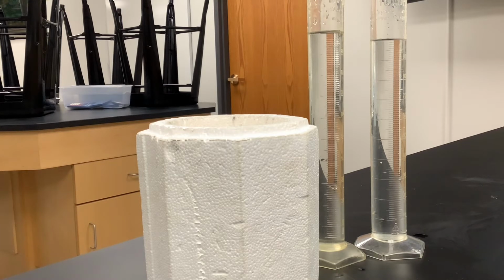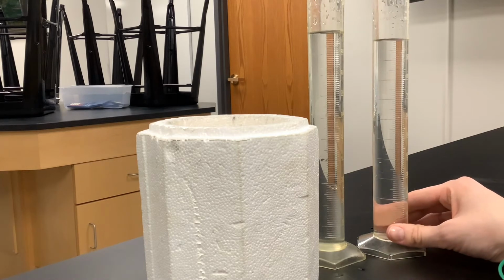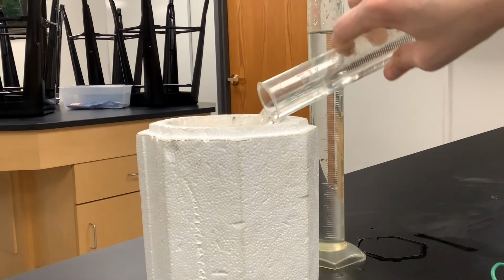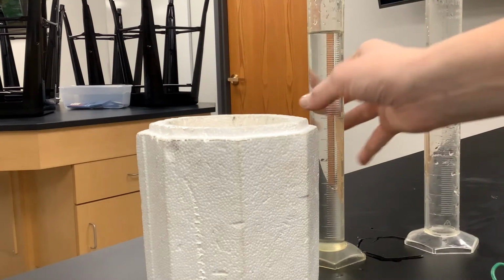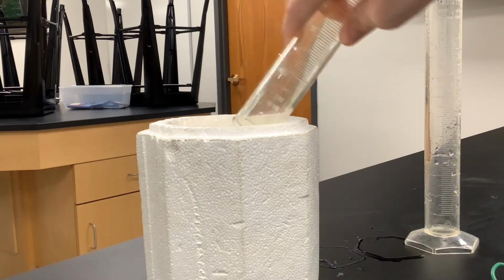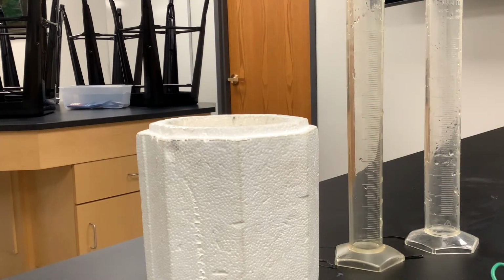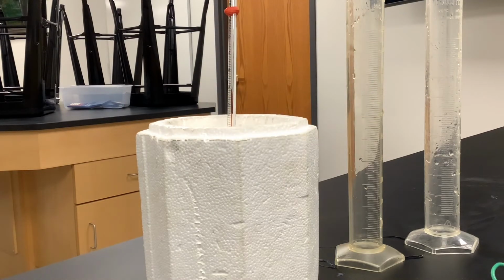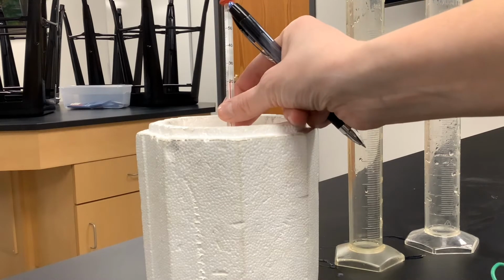I have here 2 graduated cylinders. They actually each have exactly 100.0 milliliters of water, which means we have a total of 200.0 milliliters. And because the density of water is 1 gram per milliliter, I know that 200.0 milliliters of water is going to be 200.0 grams of water. So that is the mass of calorimeter water, 200.0 grams.